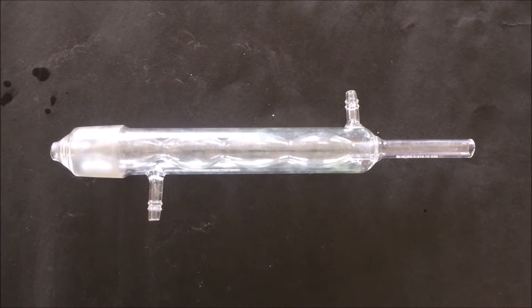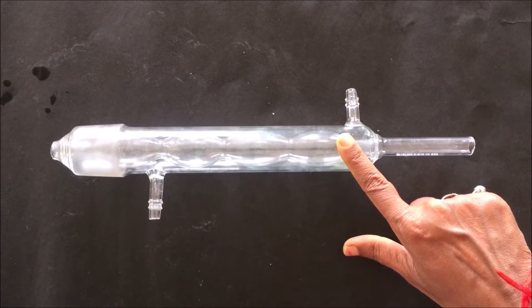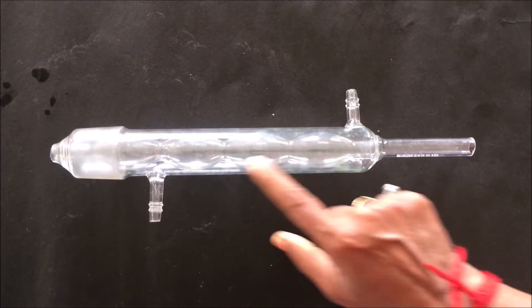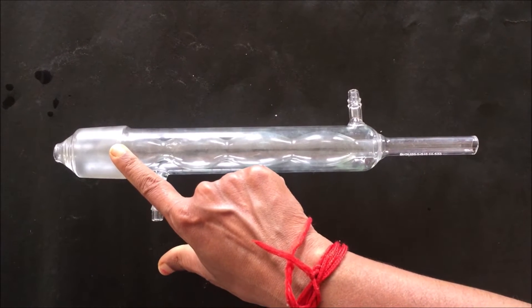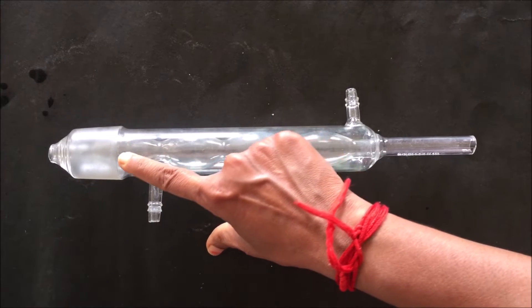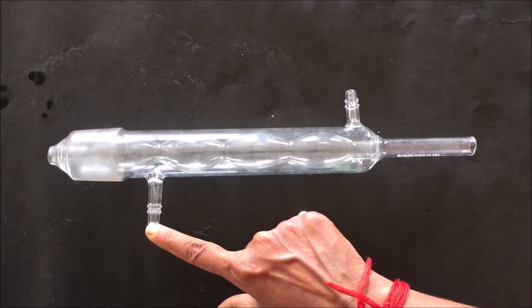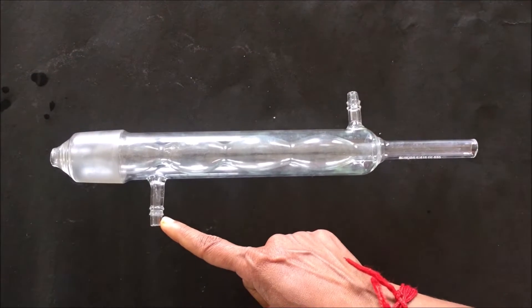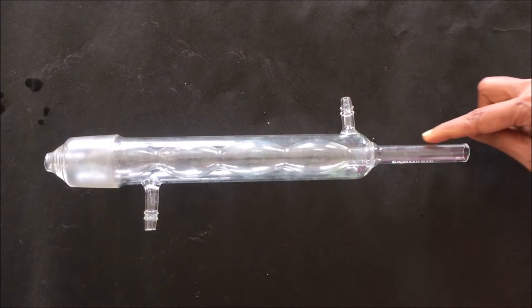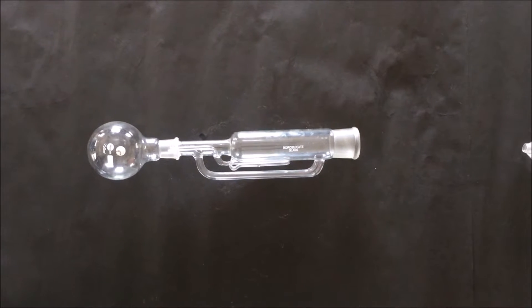This part of the Soxhlet apparatus is called the condenser. The condenser consists of two parts: the inner tube and the outer tube. The inner tube is for the vapor of the solvent and the outer tube is for the counter flow of water. This is the joint of the condenser where we attach the Soxhlet extraction chamber. This is the inlet point for cold water and this is the outlet point for hot water. This is the tube from where we add the solvent.